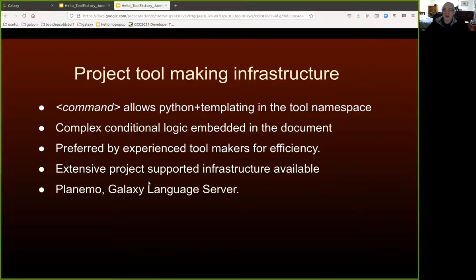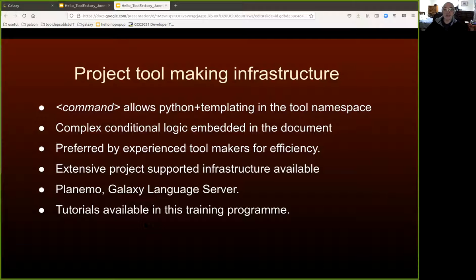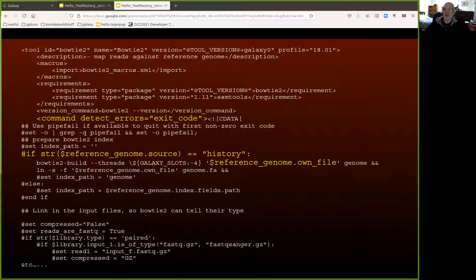The project supports that style of tool building with Planemo and the newer Galaxy language server. There are other tutorials in this training week which you can take advantage of to learn about how that infrastructure works. However, today I'm just talking about the Tool Factory. When we talk about tool wrappers, we're talking about XML documents.